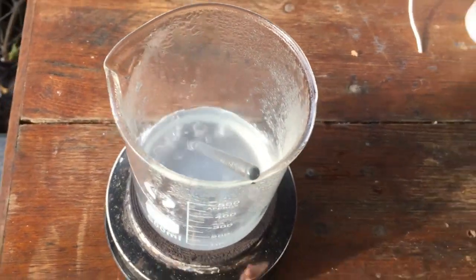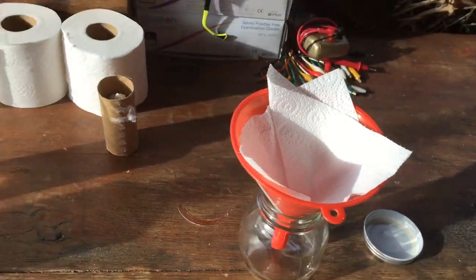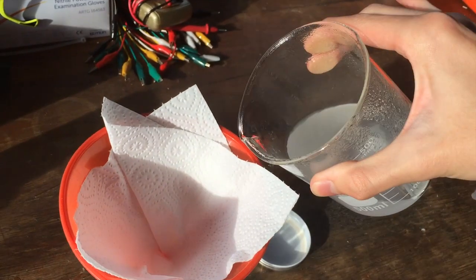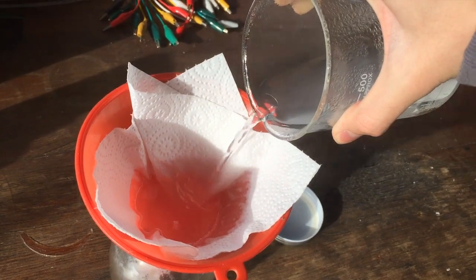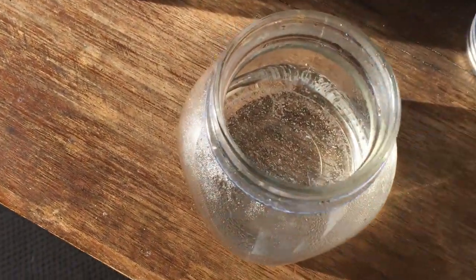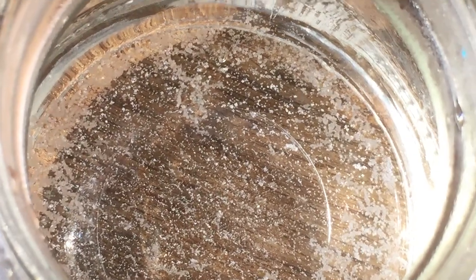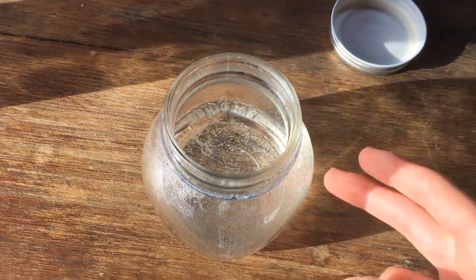What we're going to do with this solution of our mixture of salts is just filter it into this jar — that'll remove any solid impurities that are left behind. And now that filtering is done, you can see the solution is far clearer, and we can already see in the bottom there a bunch of what's hopefully potassium chloride crystals just crystallizing out as it cools down.